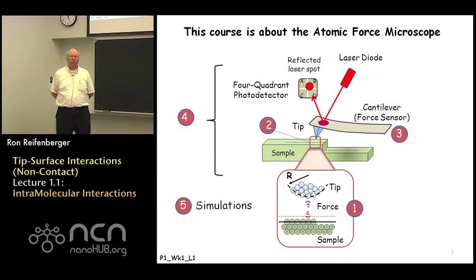Week 2, we're going to integrate those interaction forces that we discuss in week 1. We're going to integrate those to actually come up with expressions for the interaction potential energies between the tip and the substrate. And we're also going to discuss some of the properties of a substrate that are important in any atomic force microscope example. So that'll be covered in week 2 of the course.